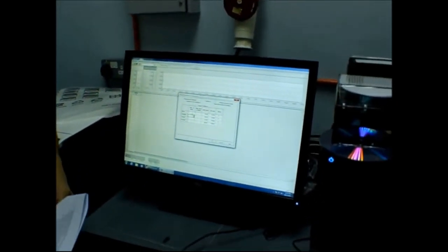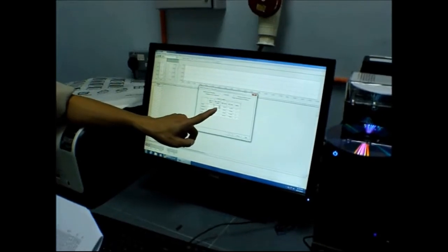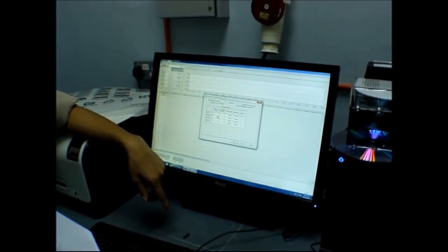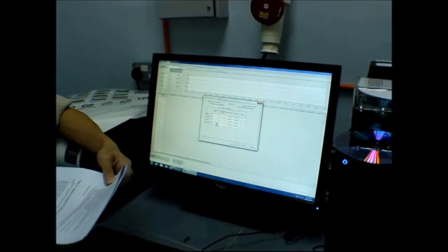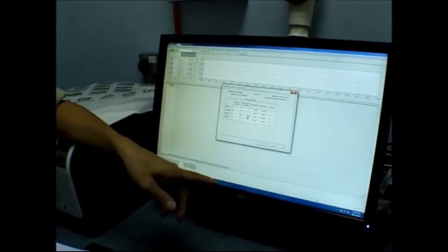So if you want 3/4 or 3/5, then you set it. 3, maximum maybe 4 or 5, depends. Everything else is the same. Okay, 3/4. Normally we put 2/3 only. 2/3. 3/4.